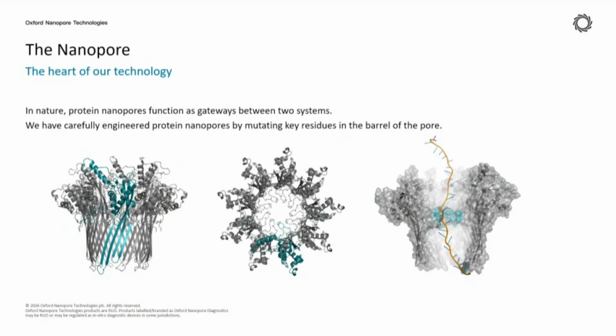When the DNA molecules pass from one region to another through these nanopores across the membrane, the signals are captured by the nanopore sequencing device. Based on the captured signals, the signals can be converted into bases. From the signals, we try to see which bases are passing through the channels, and that is basically our sequencing data.